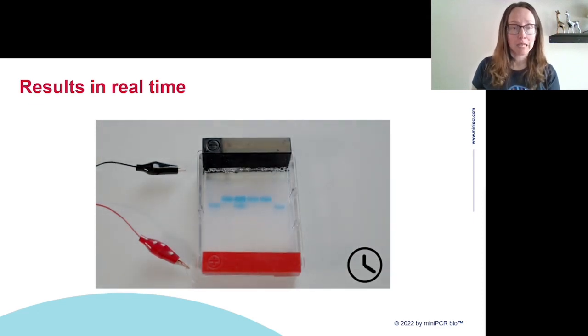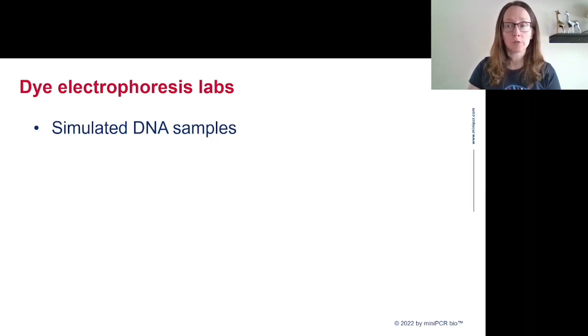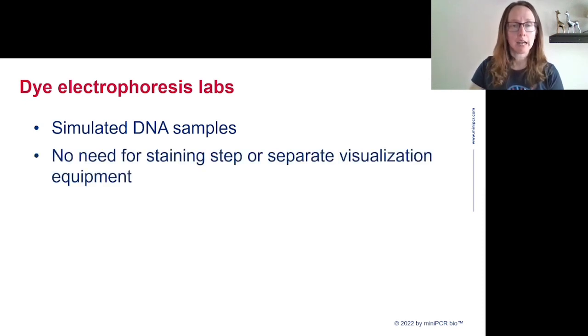We will check back in on this gel in a few minutes. But because you don't get to watch it running, here's a time-lapsed image showing what it looks like as the samples run out over 20 minutes. As you can see, the results are visible immediately. There's no need for a separate staining step or additional visualization equipment. What you load into Bandit is up to you. You can run DNA in a Bandit gel, but visualizing DNA with the system will require additional protocols to stain the DNA and additional equipment to view your samples with.